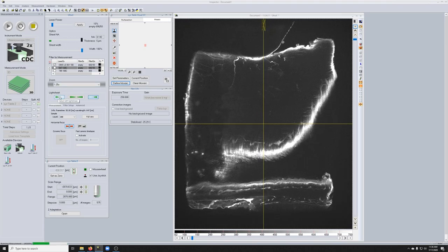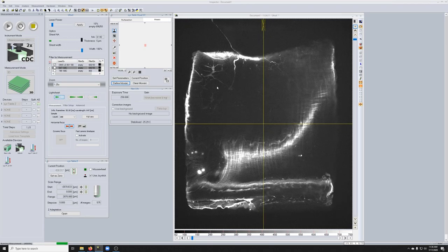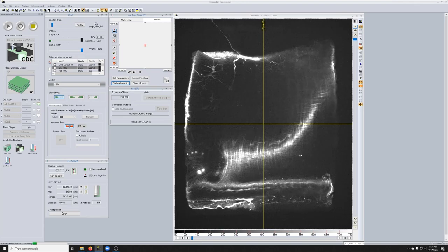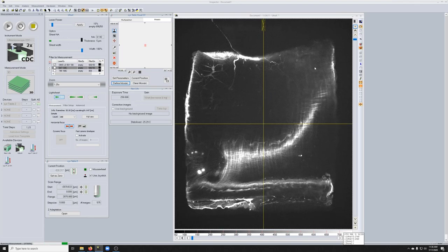But if we switch to the left light sheet, now we can see that this side looks pretty good, but then the other one is maybe not so great.